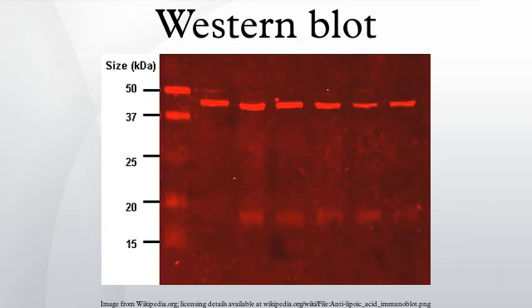The primary probe is incubated with the membrane in a manner similar to that for the primary antibody in a 2-step process, and then is ready for direct detection after a series of wash steps. Analysis: after the unbound probes are washed away, the Western blot is ready for detection of the probes that are labeled and bound to the protein of interest.